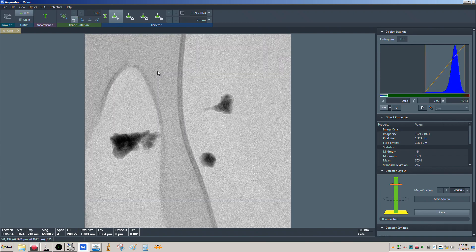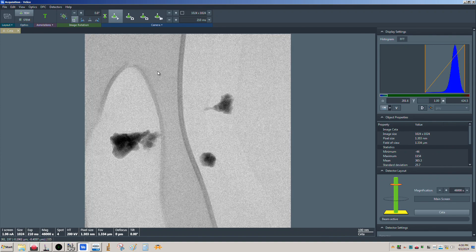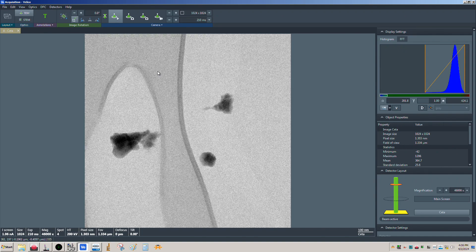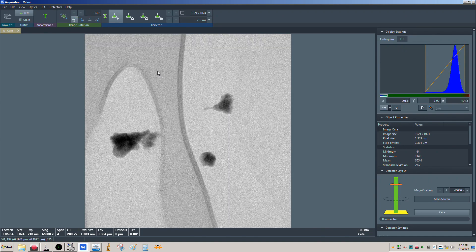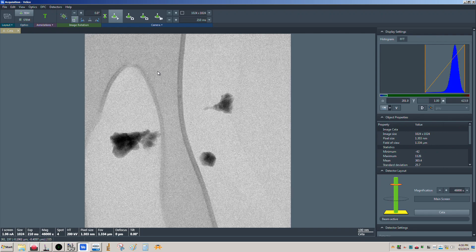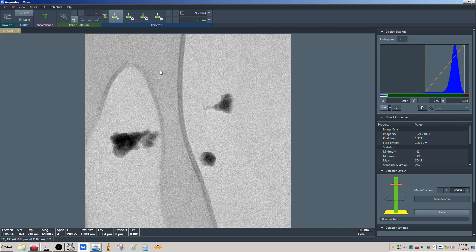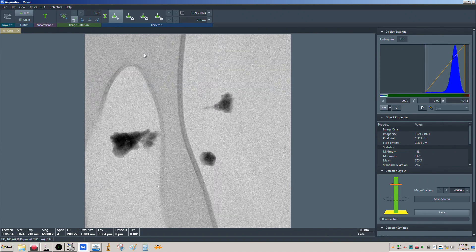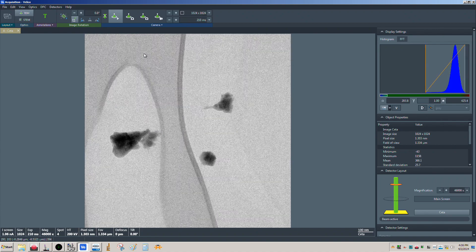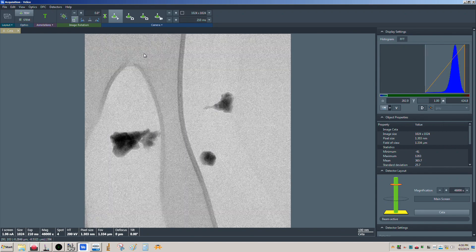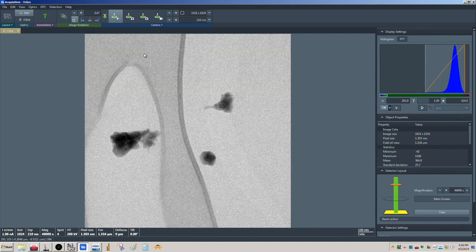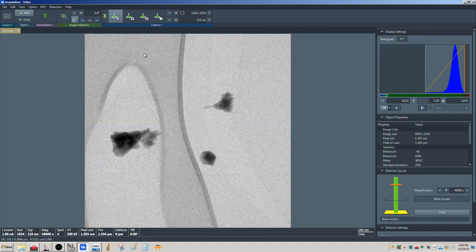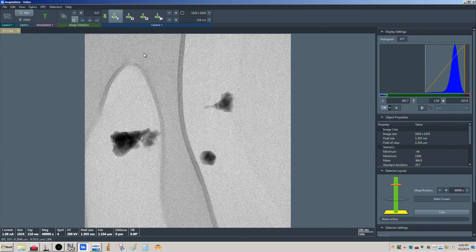DCFI in TEM mode doesn't get the usage that it does in STEM mode. Part of the reason is that in TEM mode your acquisition times are much shorter — usually just a second or two to acquire an image, whereas it can be the better part of a minute for a STEM image. So you tend to be less affected by instability in TEM imaging.